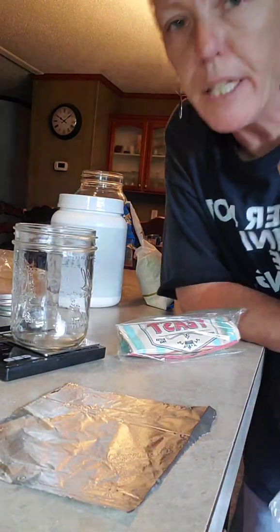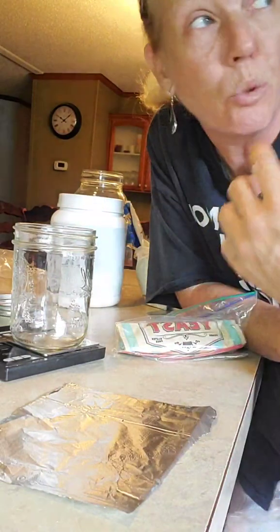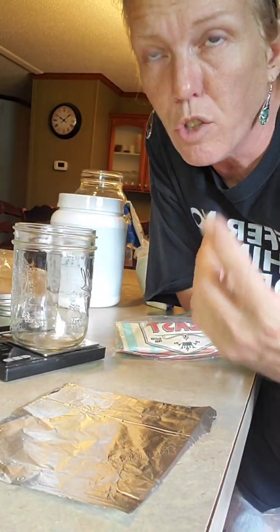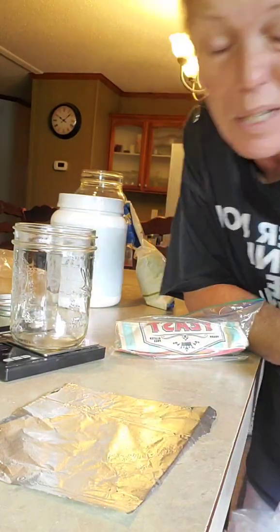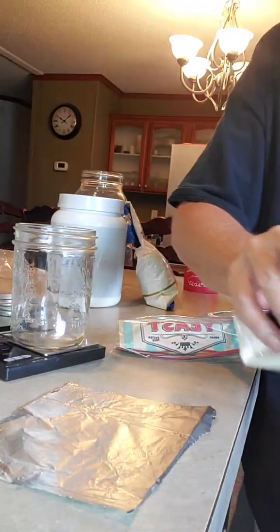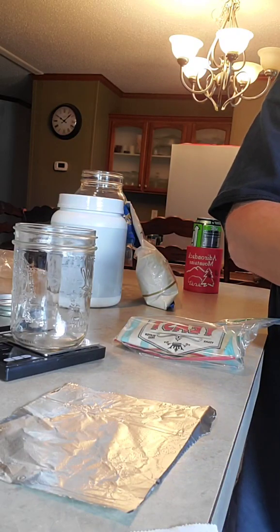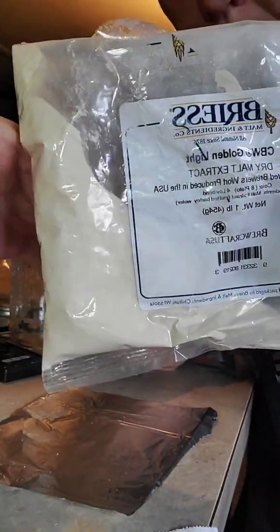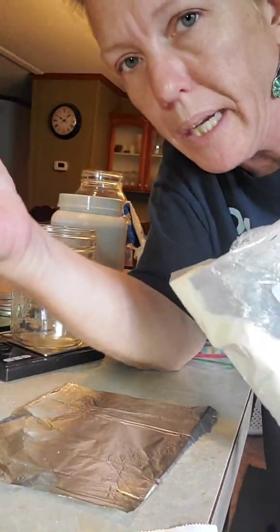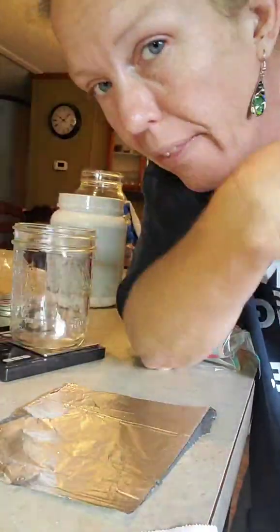And malt extract, I use what they call a golden light. There are dark extracts, but pretty much for mycology, you want to use a lighter extract because darker extracts can hide all your contamination that you may get. It's going to be hard as hell to read this because it is old. But my malt extract, it's a real light extract. This is your sugar when it comes to malt extract agar. So, malt extract agar, again, is this agar powder and water. That's it.